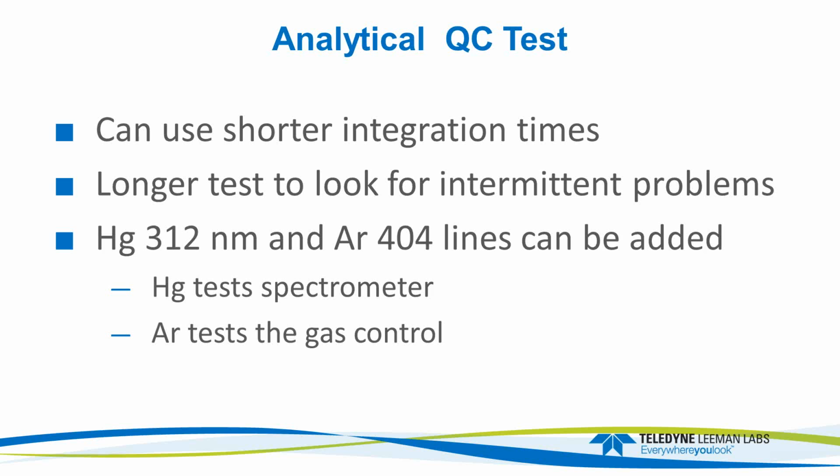It may actually have to do with the positioning of the mirror going back and forth. And this test, in addition to testing the RF and the optics, is also testing that mirror. So it's adding one more wrinkle to it. And sometimes the more things you're testing at one time, the data can be sort of confounded. Something's not right, but now you're testing a bunch of things at once. So there are tests you can do specifically to test the mirrors that we're not going to cover, a little bit more on the advanced side.